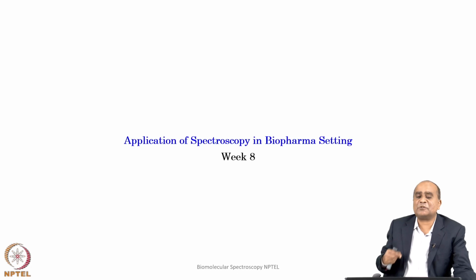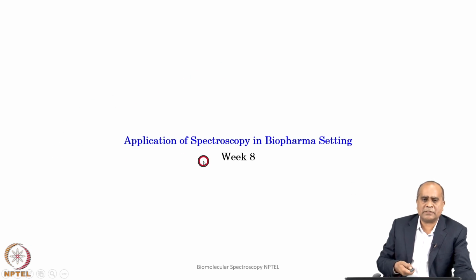So, with this we have already discussed many of these techniques and where we are going to use these in our research. The last week I want to keep as a bonus for some of you who aspire to work in industry. These spectroscopic techniques are extremely important in the biopharma industry, and this week I will be focusing on how you can use spectroscopy in industry. Today and in the next lecture we are also going to look at how we can use this spectroscopy in a biopharma setting.